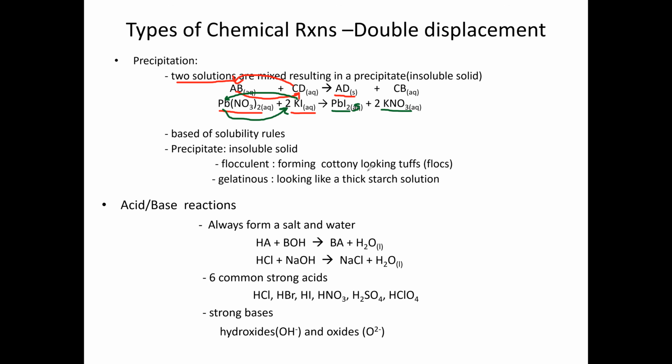And again, this insoluble solid called the precipitate, we like to describe the appearance of the precipitate. Is it flocculent? Is it gelatinous? Is it suspended? Does it settle to the bottom, etc.? So make sure you write observations when you encounter a precipitation reaction.